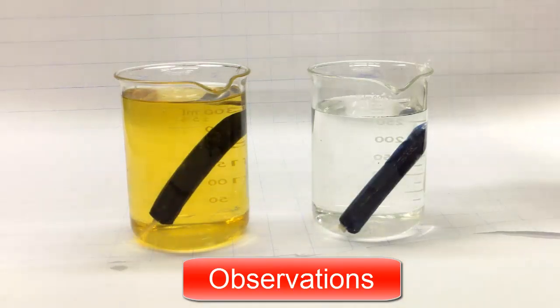The inside of both of these cells has turned blue, which is an indication that the iodine has reacted with the starch. We know also that the starch did not diffuse out of the cell because the outside of the cell would be blue, and that did not happen.